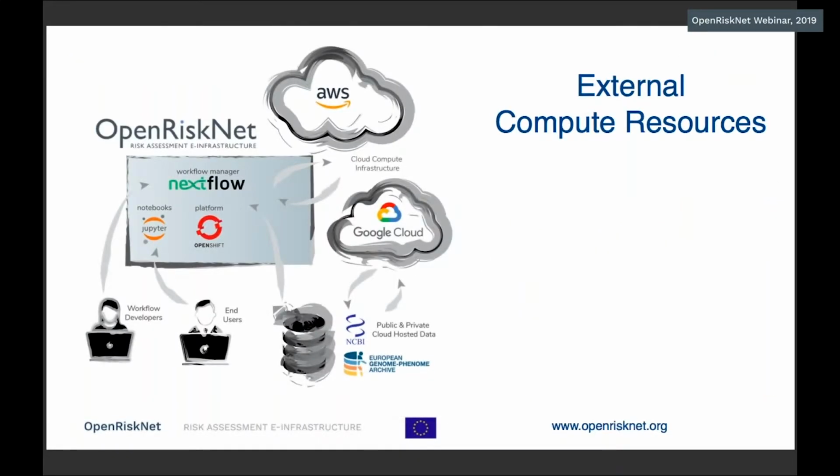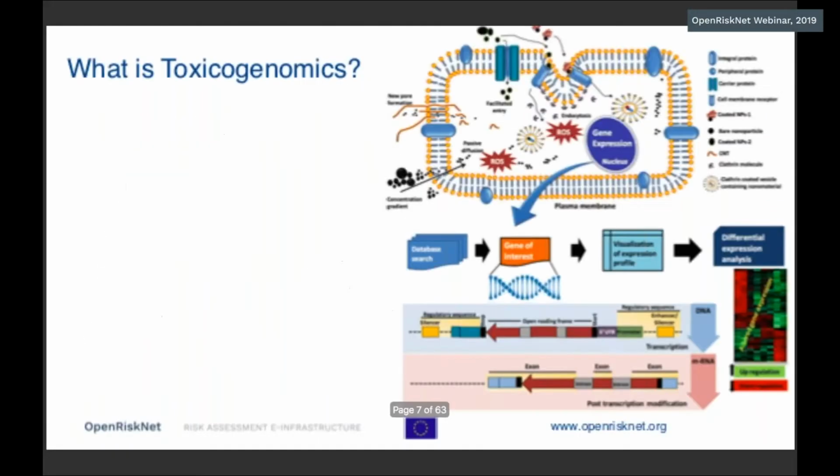So the ultimate goal of that is to use that genetic information to understand the molecular mechanism and what's occurring in the cell. By understanding the expression of the genes, whether something goes up or down in response, we can determine if something is toxic, and possibly look at molecular biomarkers, so an expression pattern or a signal made up of multiple genes together, to predict toxicology, or to predict toxicity specifically.